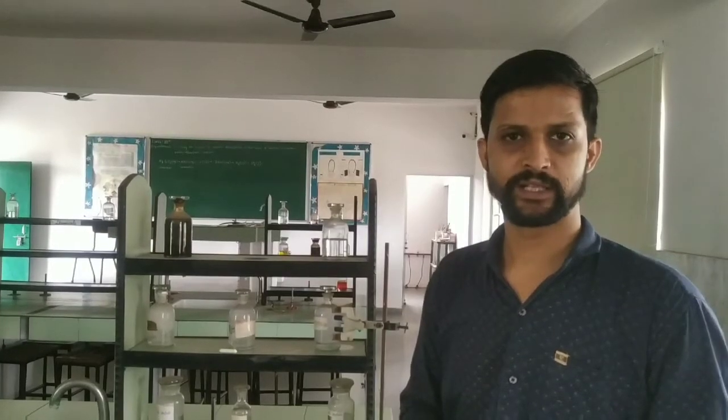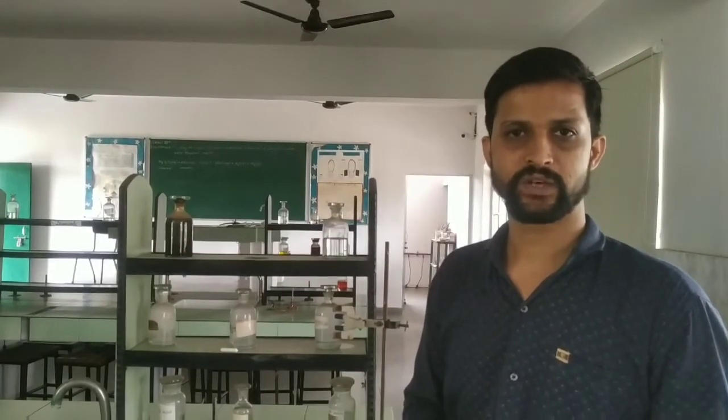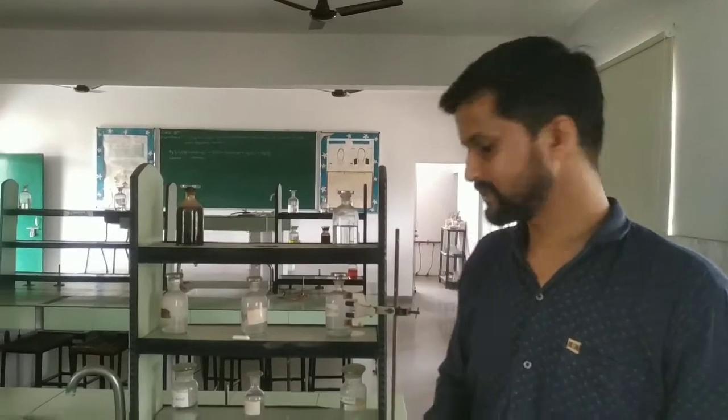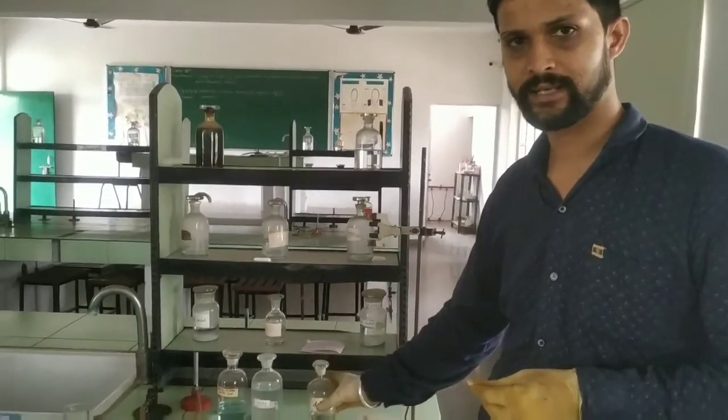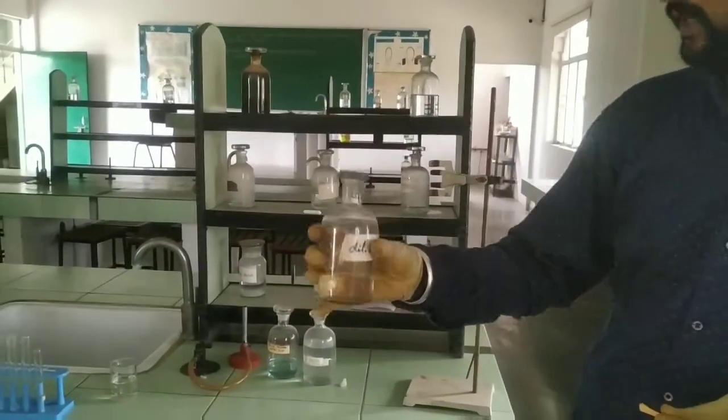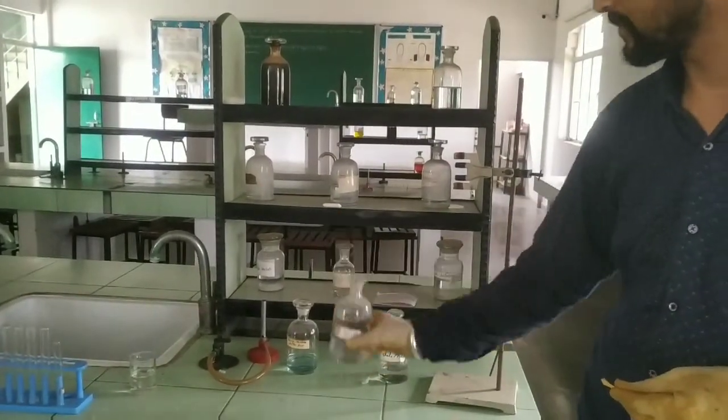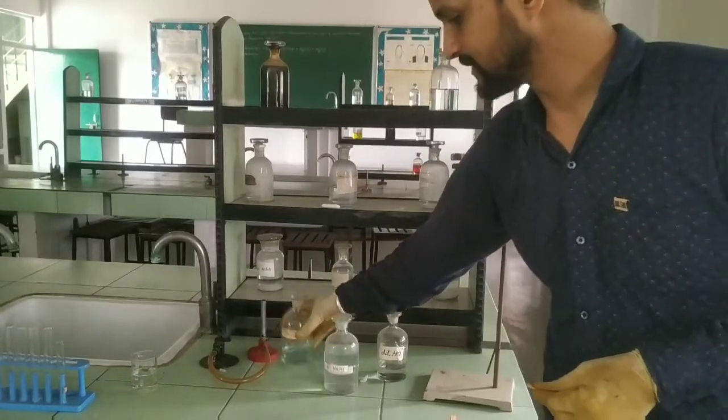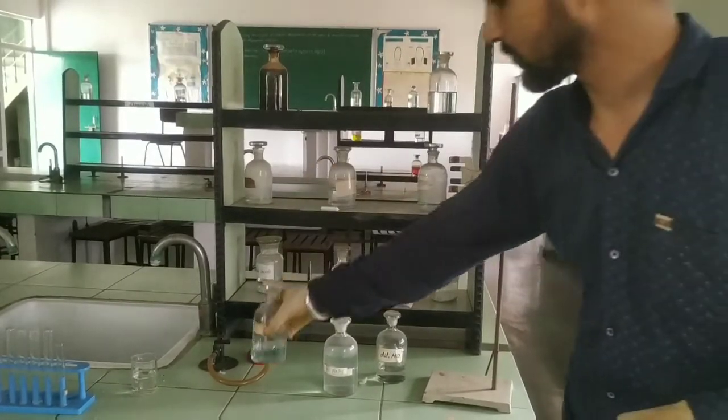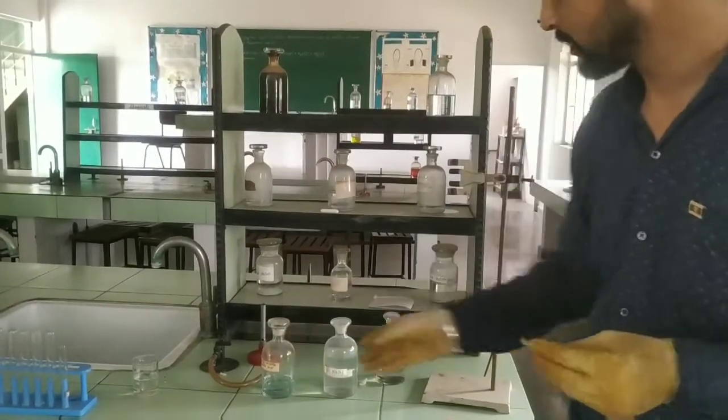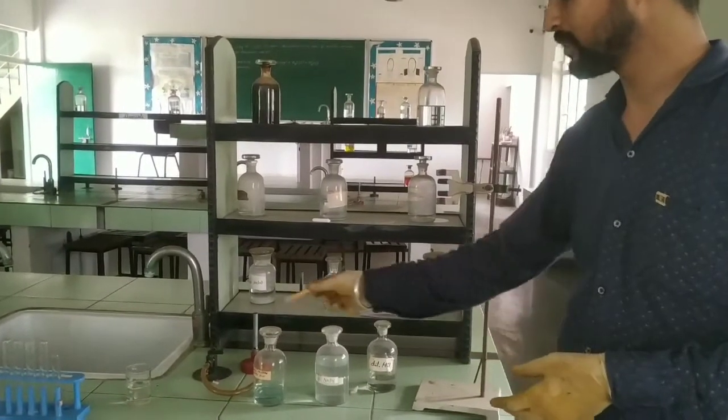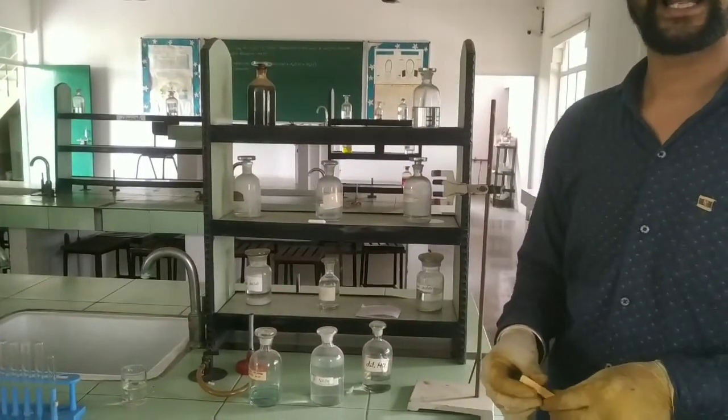Friends, we have the experiment to determine the pH of the following samples. The samples are dilute HCl, here this is the dilute HCl, dilute sodium hydroxide, dilute acetic acid, and water. So here we have to find the pH of all these samples.